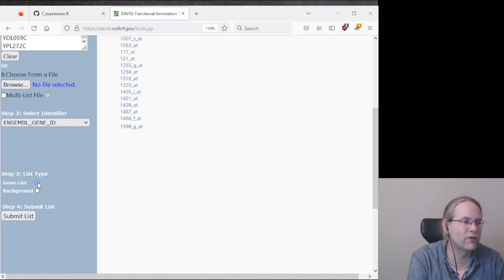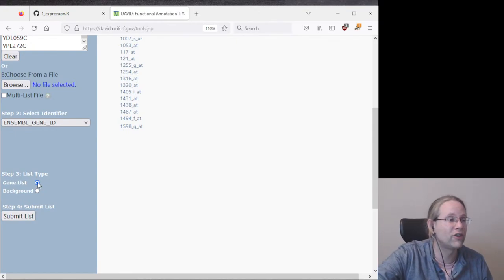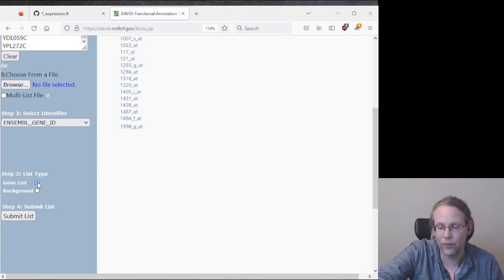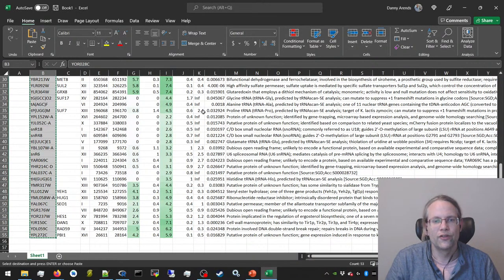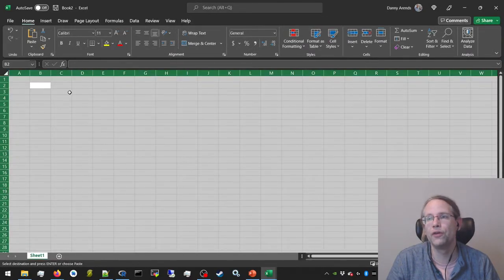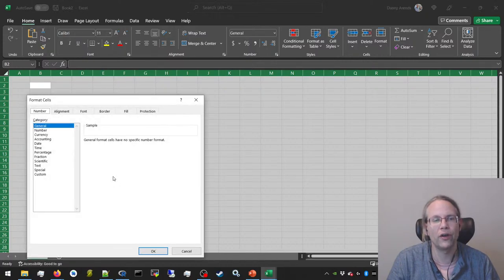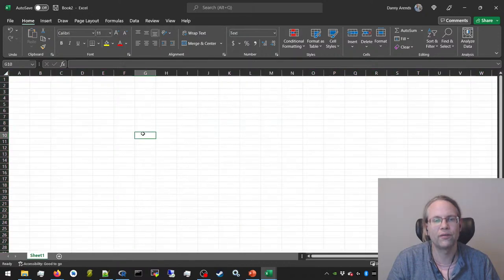But isn't Excel notorious for changing gene names into dates? How would you avoid that? Ah, good question, Linus. There is actually a really, really easy way to avoid that. So let me go back to here. What you should do, right, is say, give me a new blank workbook, right? Then you select all of the fields of the workbook, you right click it, and then you say format cells. And then you say, I want them all to be text.